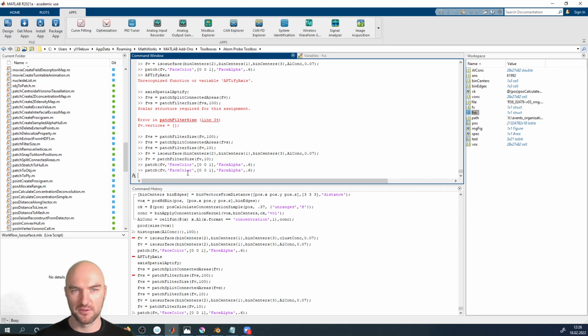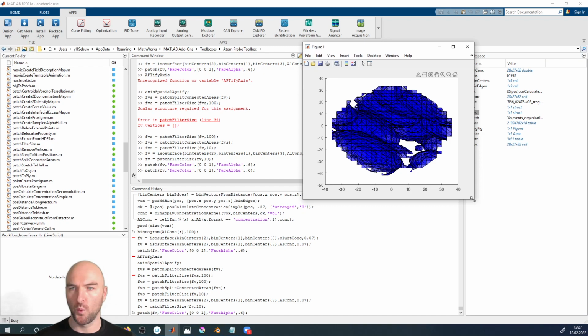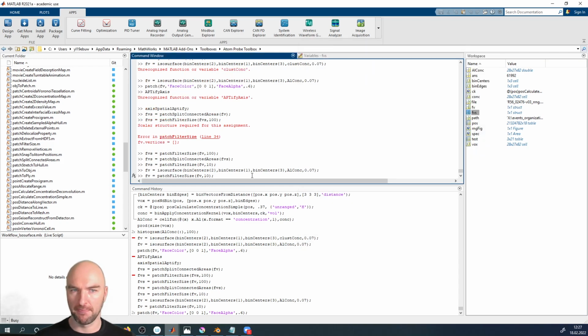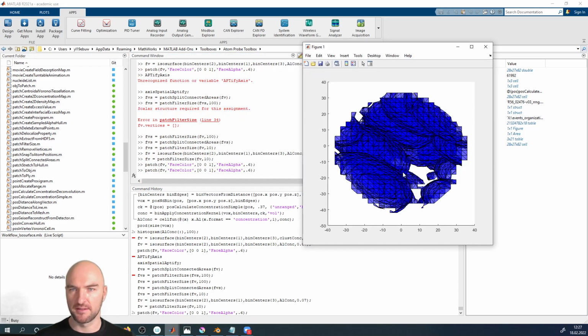Why did MATLAB slow down? What is MATLAB still doing? Shouldn't be doing anything.